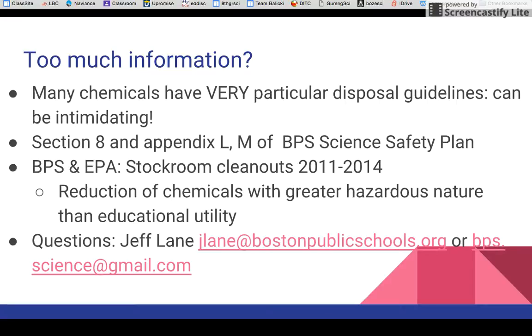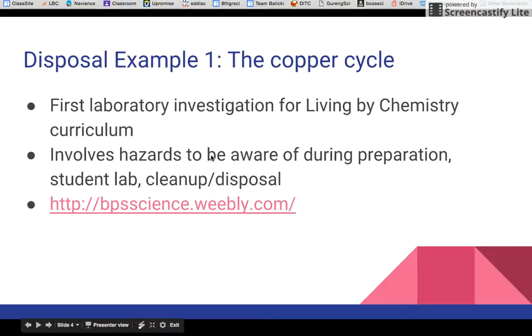Jeff Lane from Facilities, whose email address is on the screen here, can support people in any way that they need it. He is the point person for chemical disposal questions. And you can always send an email to bps.science@gmail.com if you have any questions as well. So let me go through some examples of how we would find out how to properly dispose of chemicals.